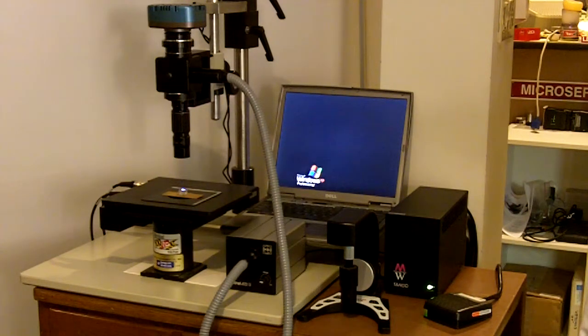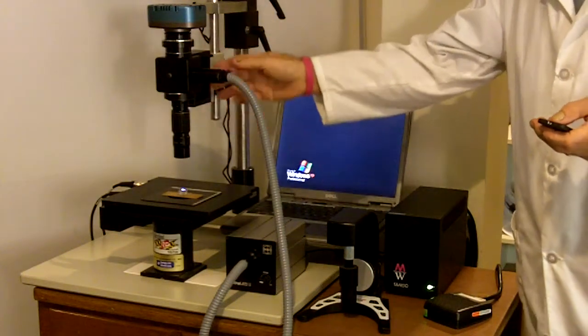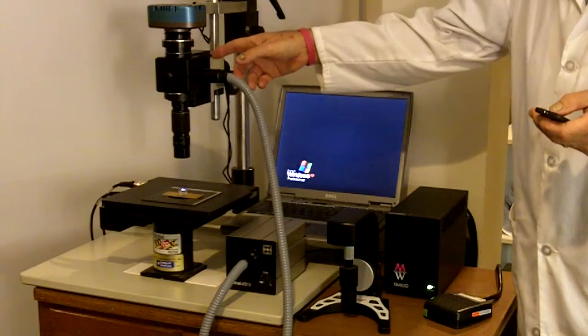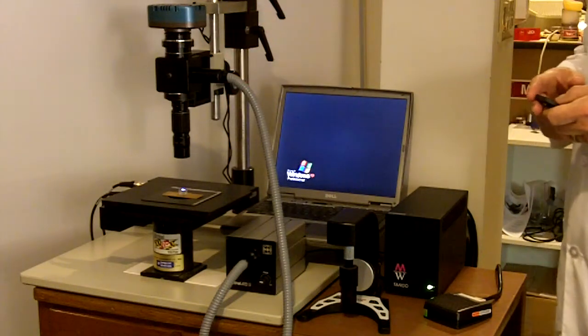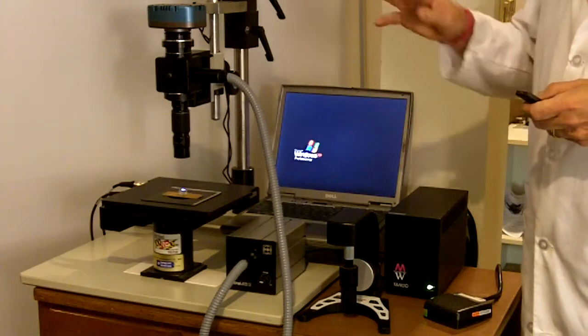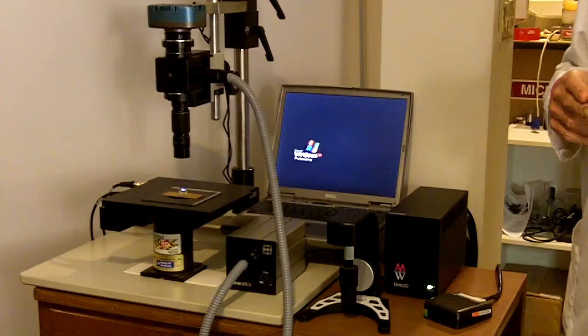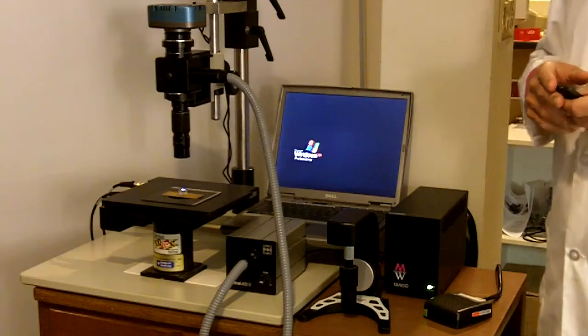Here you see a complete system with the microscope attached to a 1 quarter 20 bracket on a fairly conventional support stand. The beauty of this system, it has three mounting points so that you can mount it on a stereo microscope stand or a stand of your own design.